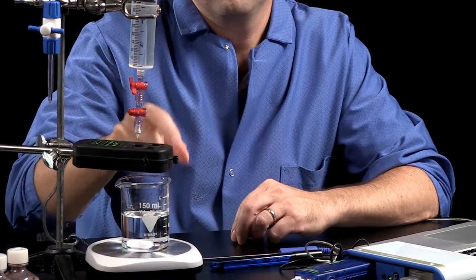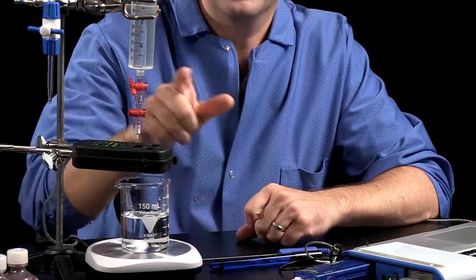Titrations are a valuable analytical tool in chemistry. If you can measure the property of a solution as you add some reactant to it, then when you see a change in that measurable property, then you know the reaction is complete.